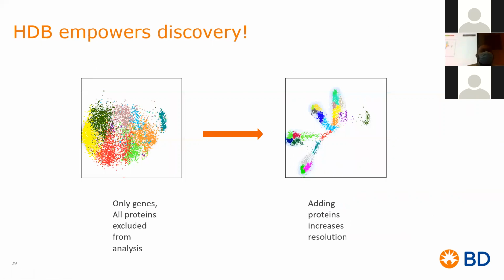So what do we know? Then I think I demonstrated that if you only use genes or only proteins, you only get half a story. And I showed you with relevant actual experiment data, some wet lab experiment. But when you incorporate proteins to your multiomic experiment, you're now able to tell a story about trajectory.